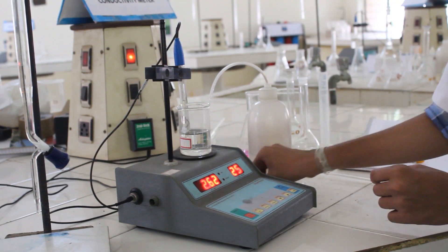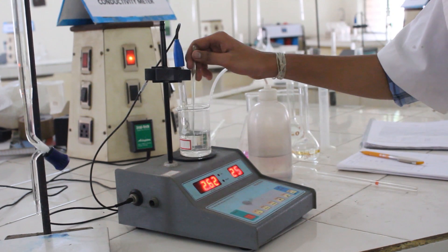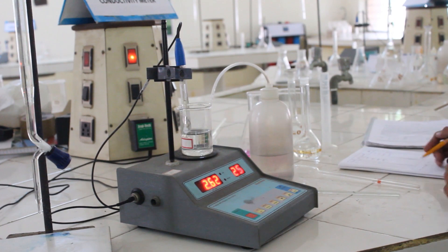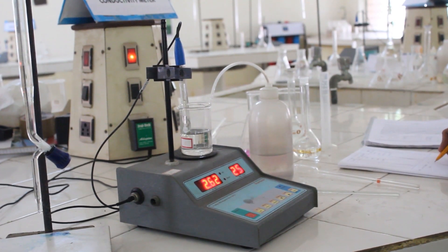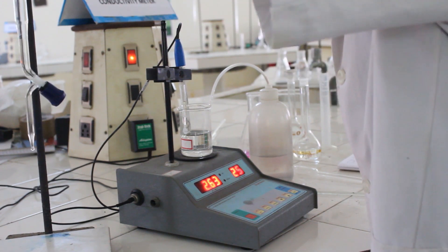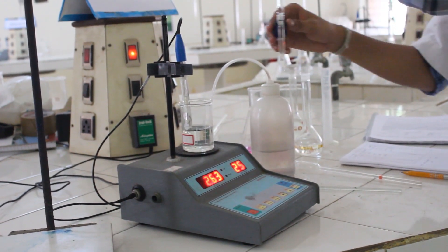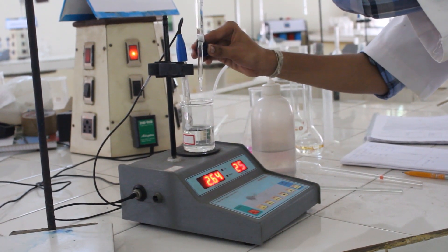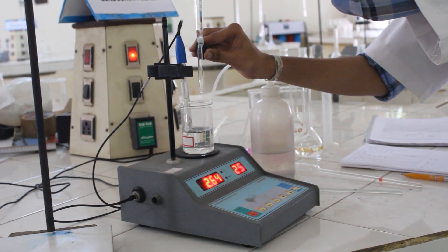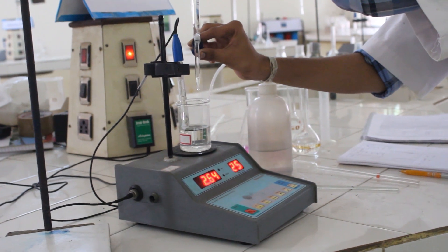Now insert the glass membrane electrode into the mixture. Using the glass membrane electrode, mix the solution thoroughly to make it homogeneous and record the stable value as zero reading. Now from the burette add 1 ml of sodium hydroxide solution into the beaker. Stir the mixture and record the values. Continue this process until we find a sudden rise in the pH of the solution as the reaction proceeds toward neutralization.